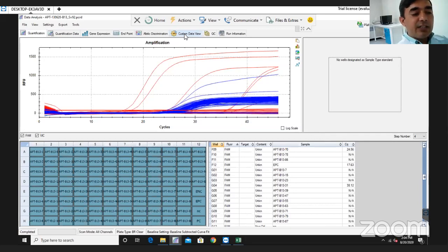But in the current pandemic situation, in our lab setup, we don't work on quantification, because we work continuously only to report positive and negative detection. Still, for determining the viral load, we need to serially dilute the positive control and run it on the PCR machine.